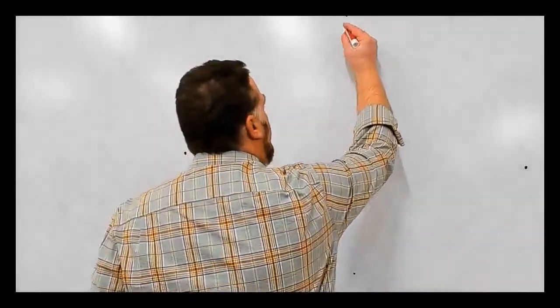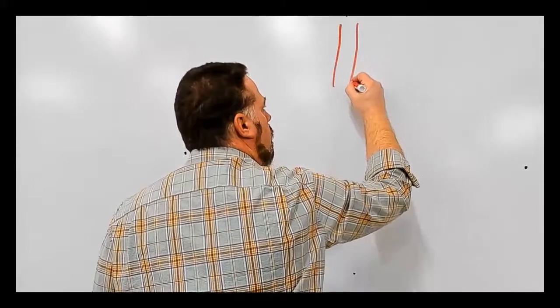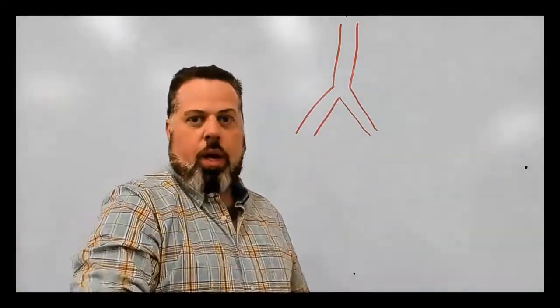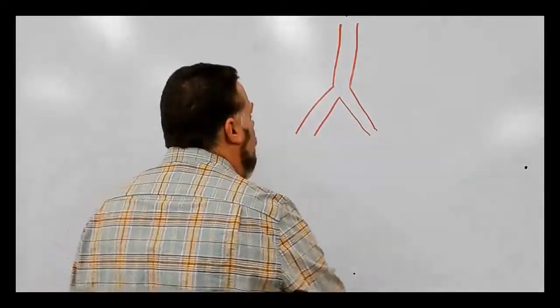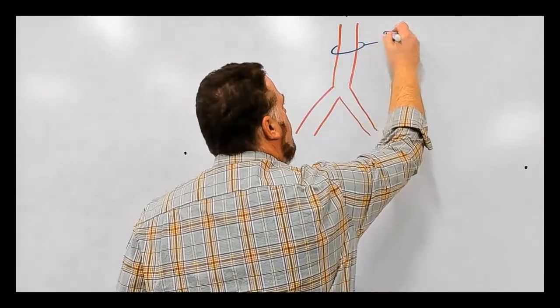So what we have is happening in the legs, okay? In a human, we have this descending aorta that is going to split or bifurcate, okay? This usually happens in the area where, I mean, you can't see it, but where my belly button is, that belly button is right where this bifurcation happens. And so here, this is going to be our descending aorta.